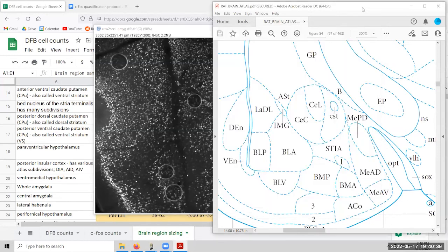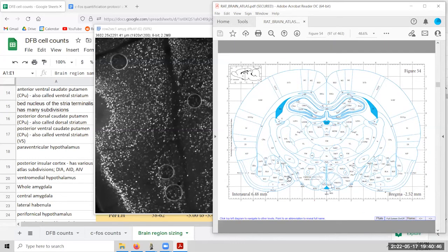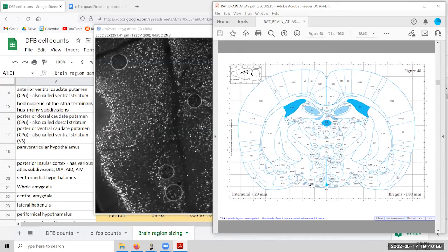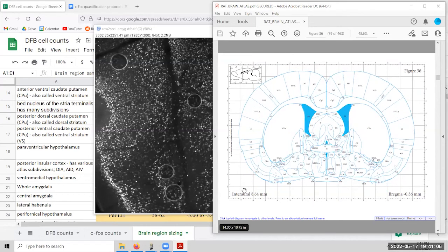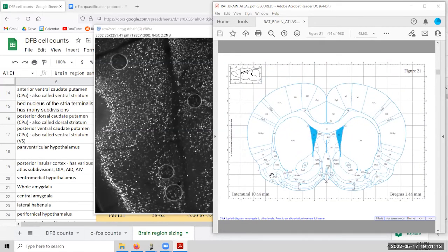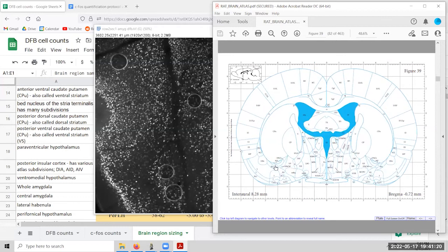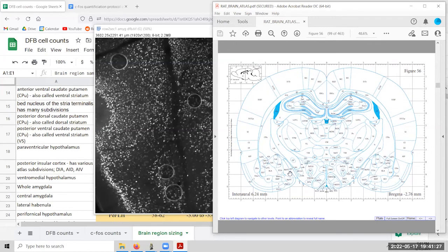We'll also want to make sure that our atlas page fits up well. And so that's where the optic tract comes into play. So watch the shape of OPT here. As I flip anterior, so more forward in the brain, the optic tract becomes much more wedge-shaped, or well, I should say more flattened. And that's as it slowly comes toward the middle and connects to the optic chiasm. And this is as we're going forward in the brain, more anterior, until we get to the very front tip of the brain.